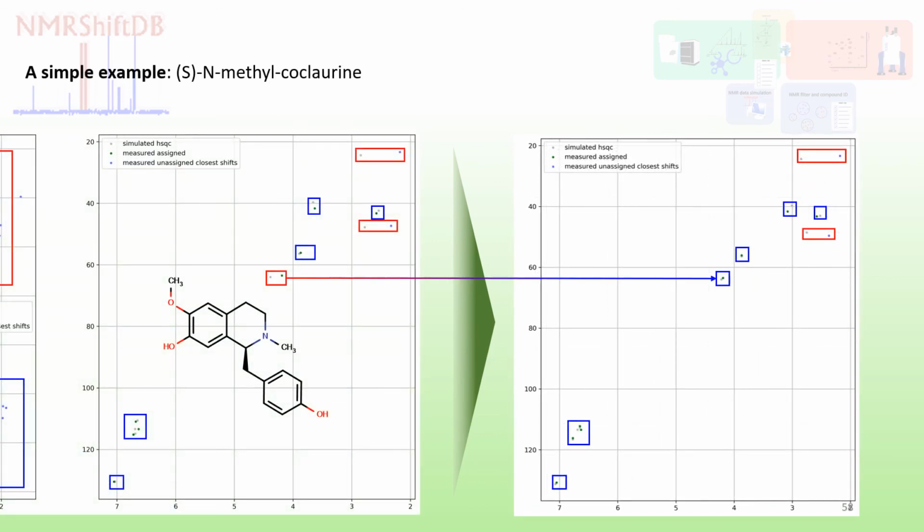In another case, the idea here is to prove that NMR data shall be better used once it's submitted. In this case, to the NMR Shift DB2, of course. We should note that maintaining an in-house database listed in tables is way less effective for fast compound identification routines. To automate this is to give a step further for development.